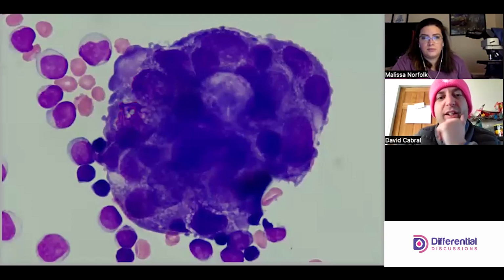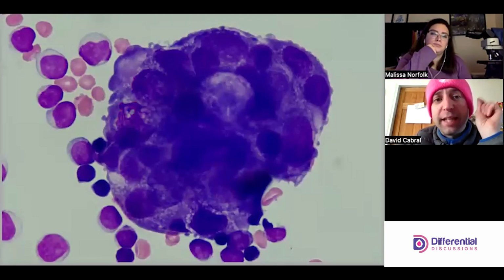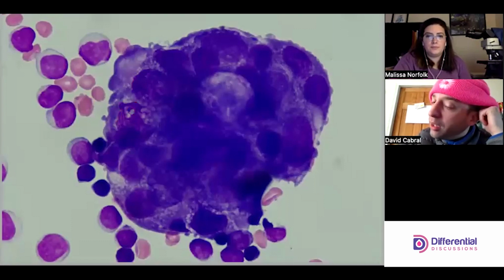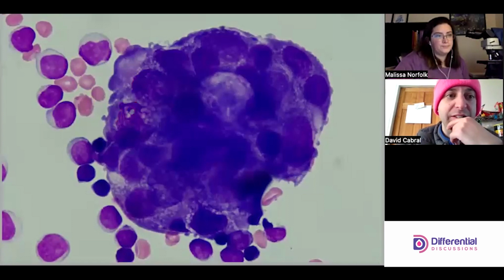Yeah, so this is a one-way ticket to path for me. I wouldn't. Yeah. But what's interesting, right? If you just went down on oil straight away, you could have easily missed these two blobs that were isolated. Now this patient might have history beyond this. Maybe this isn't the presentation, and it wouldn't be the diagnostic slide, but still, right? And in the event that it would be, it's very easy to miss.